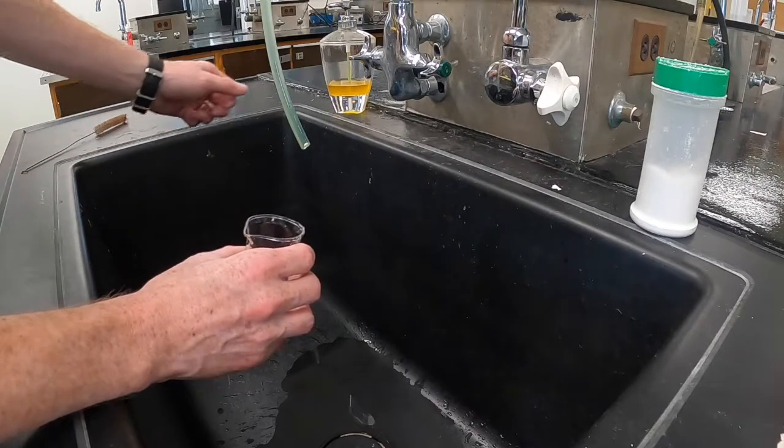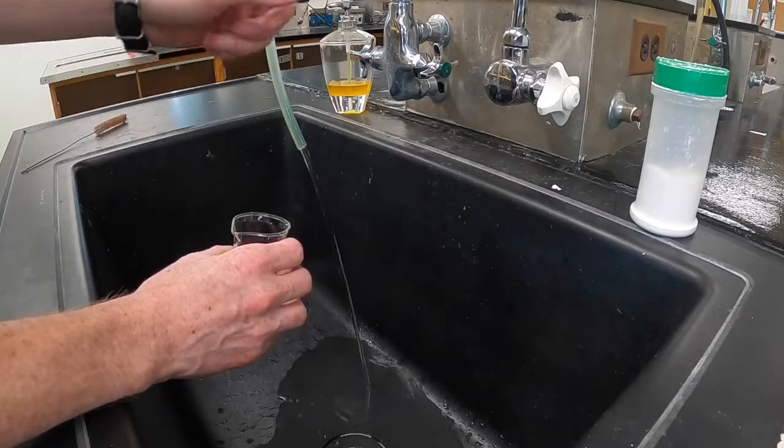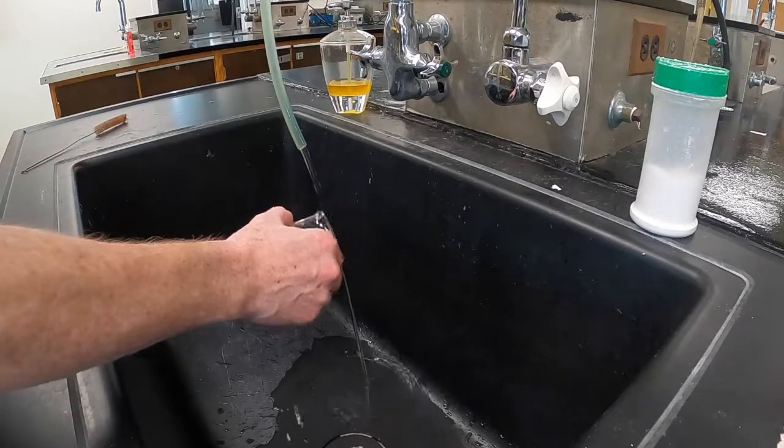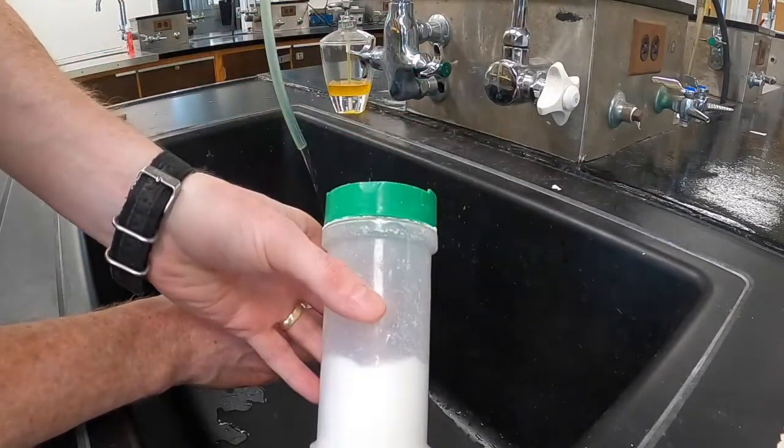Cleaning glassware has a few steps. The first one is the scrubbing step, where you add water and a glassware detergent, and you use a scrub brush to get rid of any solid that's stuck to the sides or bottom of the glassware.